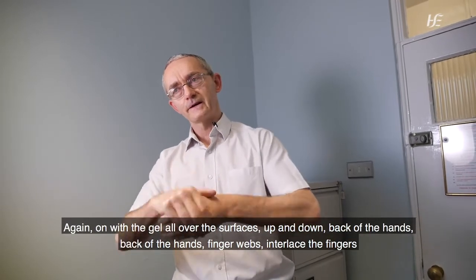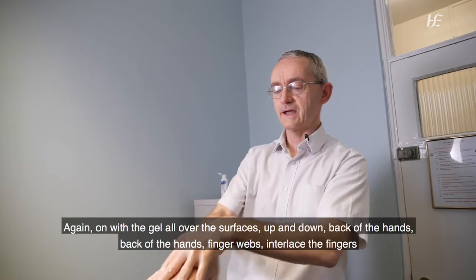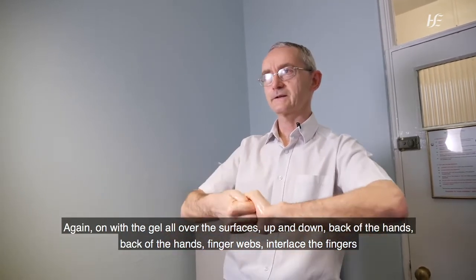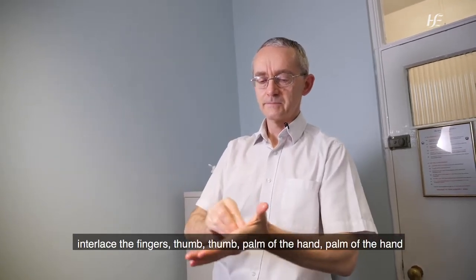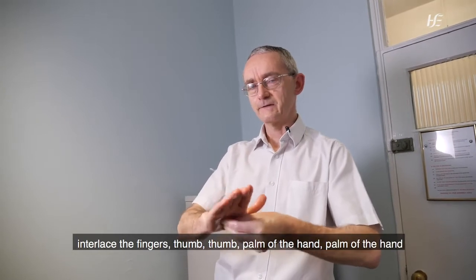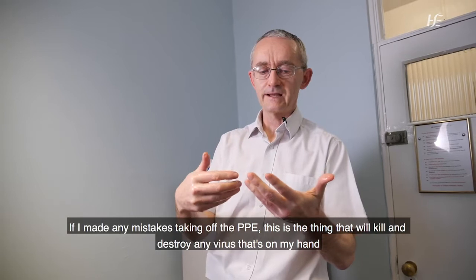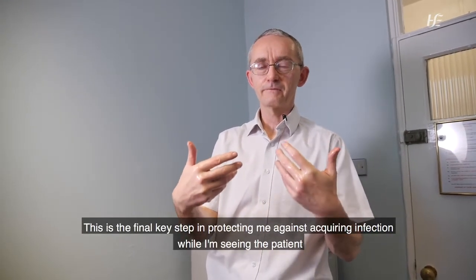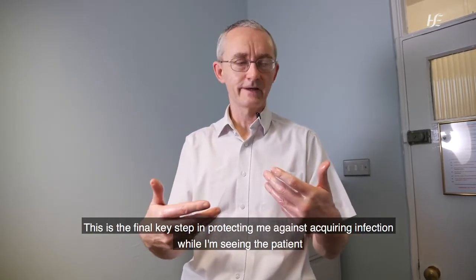all over the surfaces, up and down, back of the hands, finger webs, interlace the fingers, thumb, palm of the hand, palm of the hand. And if I made any mistakes taking off the PPE, this is the thing that will kill or destroy any virus that's on my hand. And this is the final key step in protecting me against acquiring infection while I'm seeing the patient.